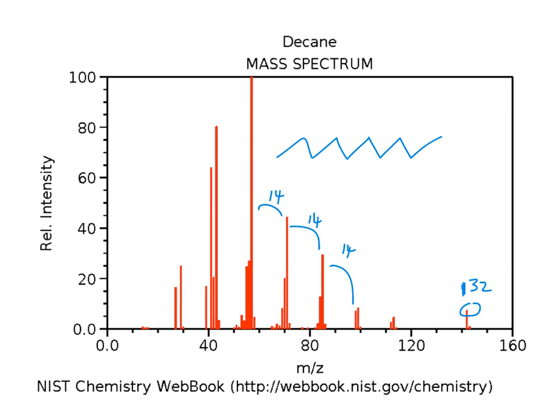The reason is that as we cleave along this chain, if we lose the long piece, we're going to have the possibilities of 43. The next bond, if it was cleaved, would be at 57. Then we could go up to 71. So we only have discrete places where it can be easily cleaved.